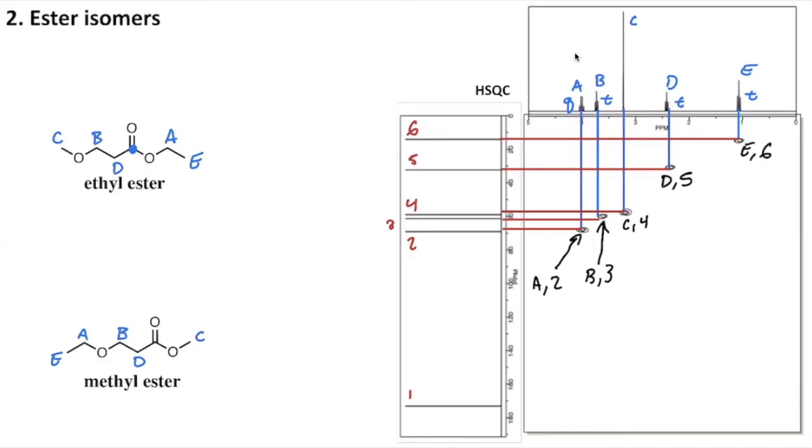Okay, so that's kind of boring, and sometimes your HSQC will be boring. It seems like, yes, the highest downfield shifted carbons correspond to the most de-shielded and downfield hydrogens. That seems sort of logical, right? But that's not always going to be the case. So you can't necessarily assume that hydrogen A is the furthest downfield, so it's probably going to be on the furthest downfield carbon. That's not always true.